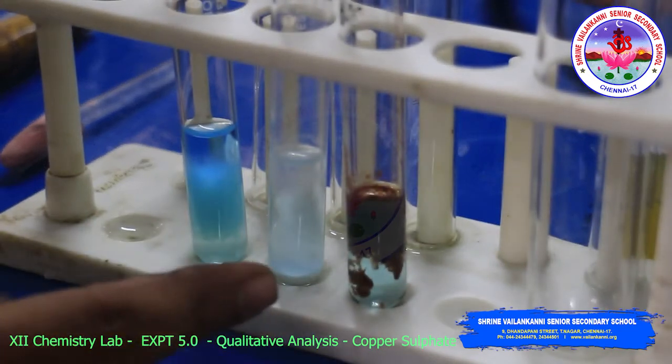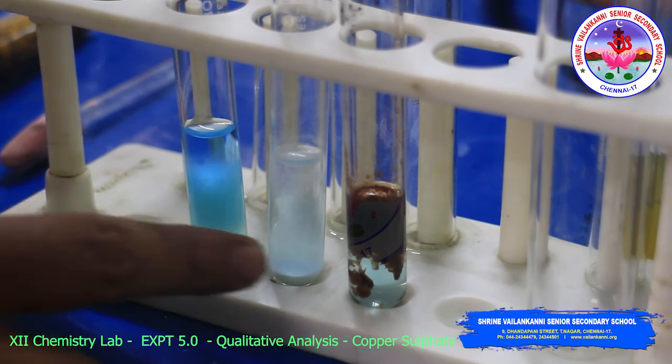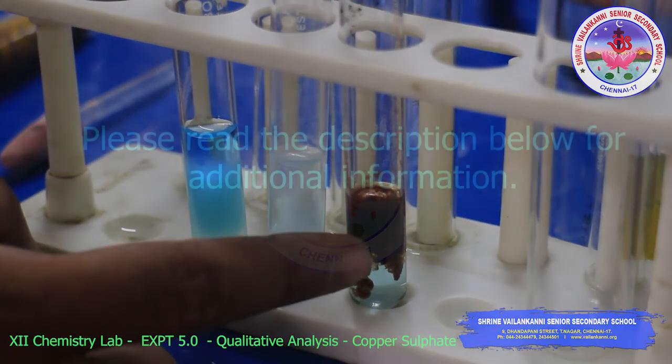Look at the confirmation tests. The first one is for sulphate, and these are the confirmation tests for copper.